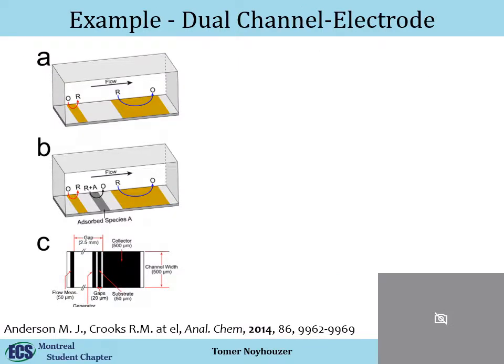Now, here's an example by Crooks from Texas. He did a dual channel flow measurement. So he had two electrodes. The first electrode, which you see is very small, reduces a species. And then in the second electrode, he oxidized this species. Now this electrode could be very, very small because you just want to apply a certain current and reduce everything. This electrode is a little bigger because you might want to have a signal that you can calculate something from. Now, A was his first prototype, and B was where he did the measurement.